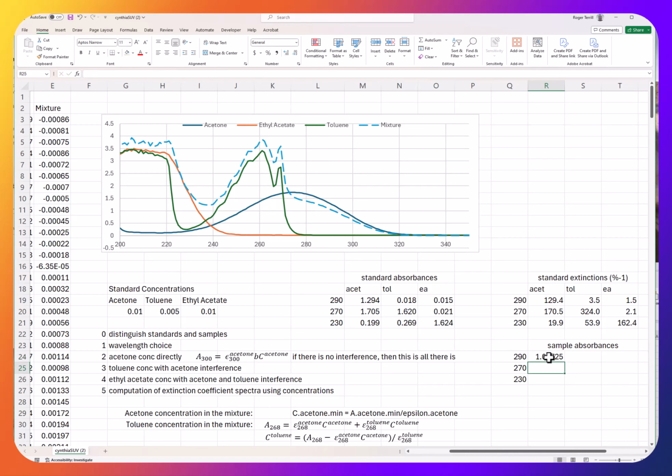This will equal E133. And this guy, let's see, what value with this guy? This guy is going to be E173.